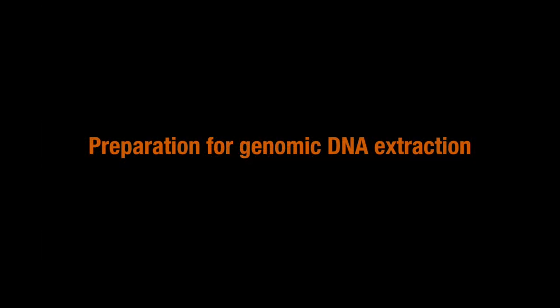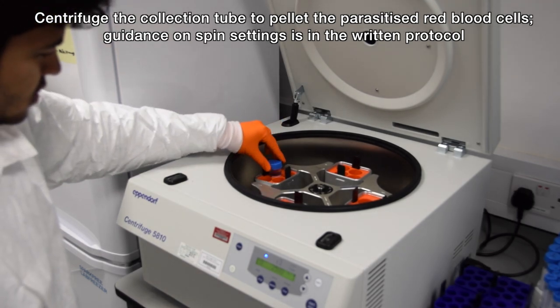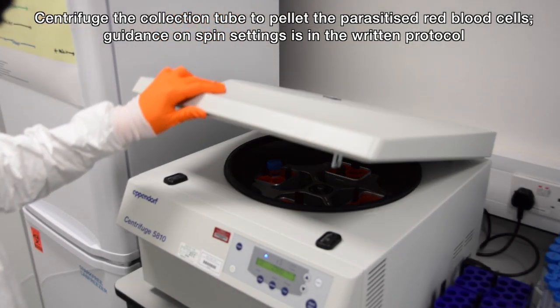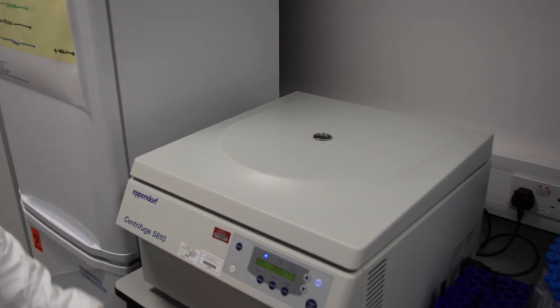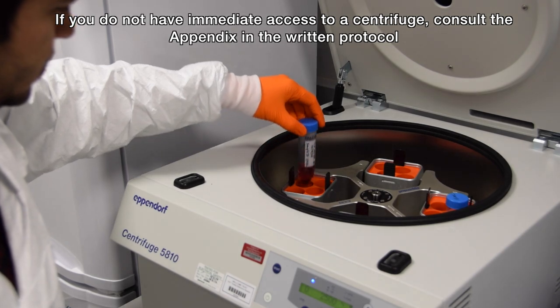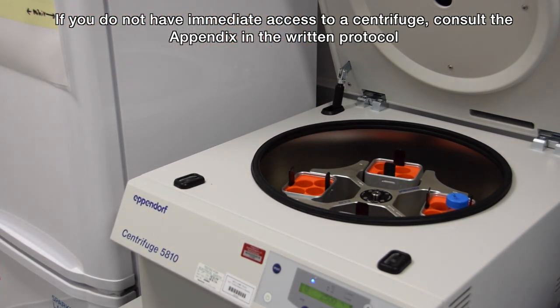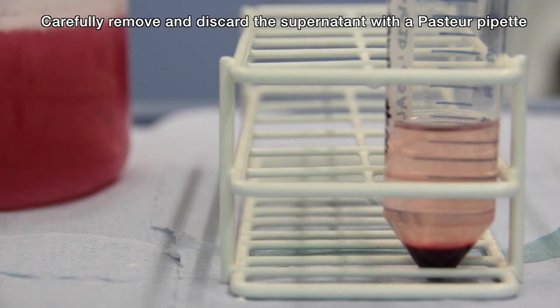For best results, immediately centrifuge the collection tube to pellet the parasitized erythrocytes. The written protocol contains guidance on calculating the settings for the centrifuge. If you do not have immediate access to a centrifuge, refer to the relevant appendix in the written protocol. Carefully remove and discard the supernatant with a Pasteur pipette.